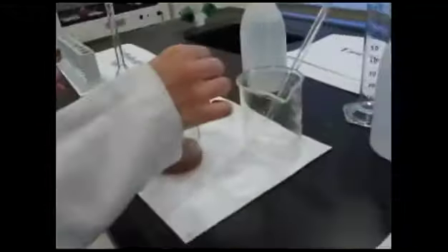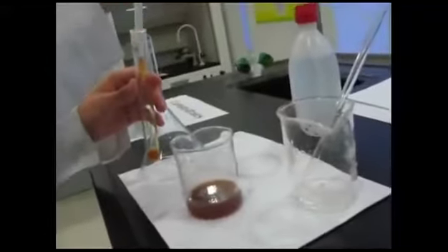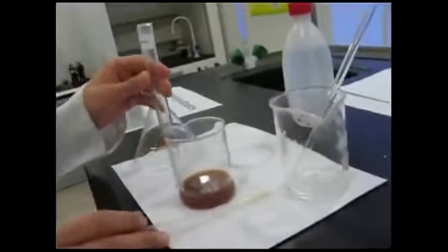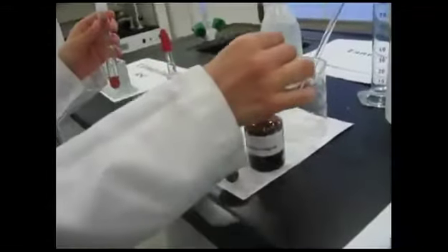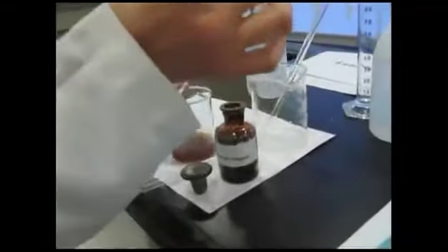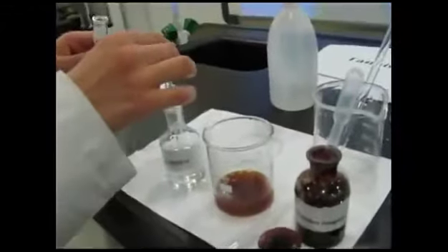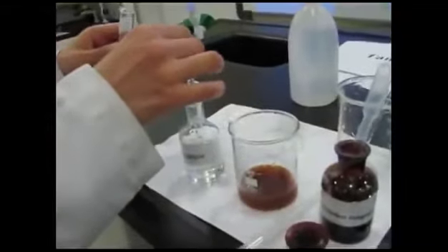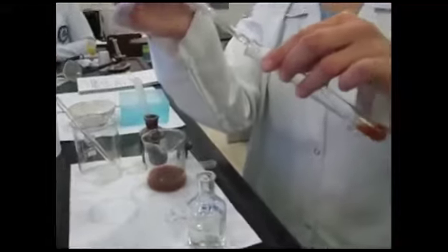First of all, we are performing the Molisch test for carbohydrates. Take 2 ml from the aqueous extract in a test tube and add a few drops of the Molisch reagent, and add a few drops of H2SO4 through the wall of the test tube.